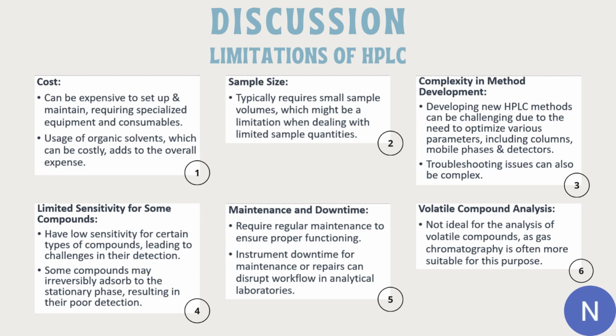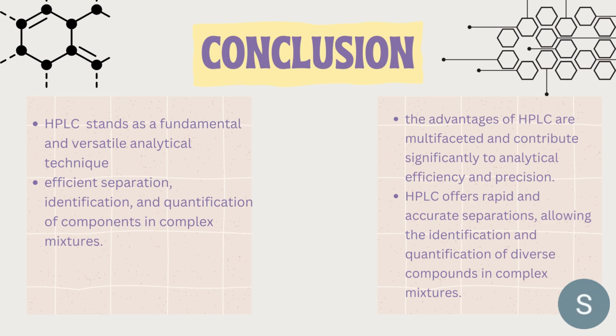The choice between HPLC and other chromatographic techniques depends on the specific requirements of the analysis and the characteristics of the compounds being studied. As for the conclusion, HPLC stands as a fundamental and versatile analytical technique with widespread applications across various industries.